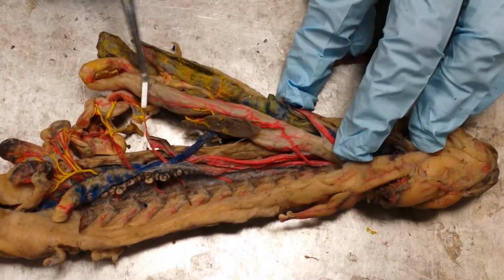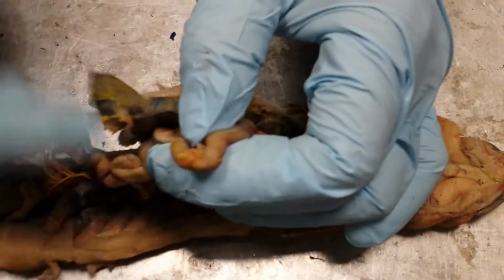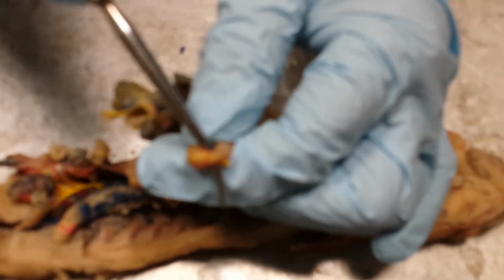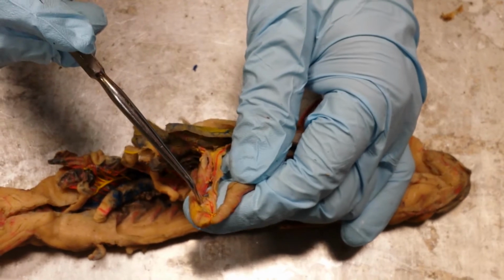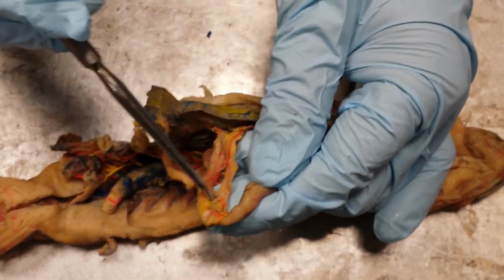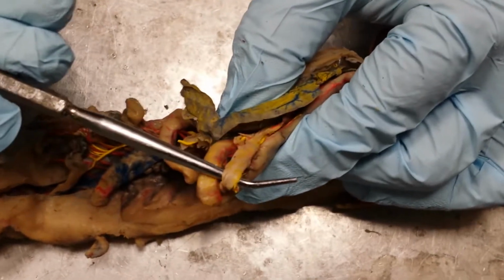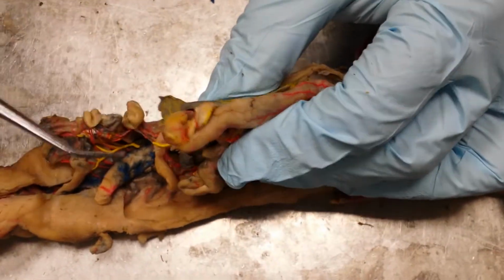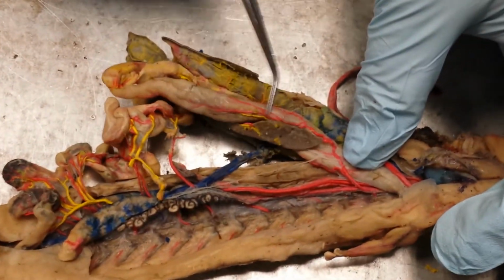This big organ here is the stomach. All right, and it runs down here to where it changes diameter. It kind of pinches to small diameter right there. That's where your pyloric sphincter is. Okay, if you look in the mesentery, that's very close to the small intestine. Right there, you'll find this chunky organ. That's a pancreas. Okay, so it's right where the pyloric sphincter is. Likewise, the spleen is up here by the stomach.